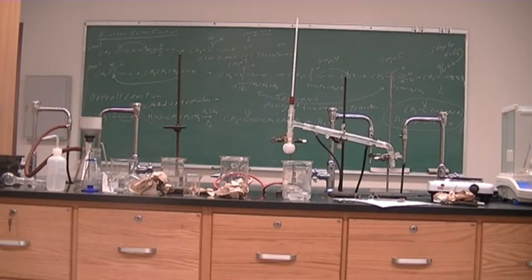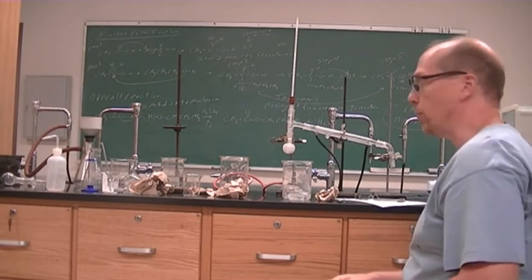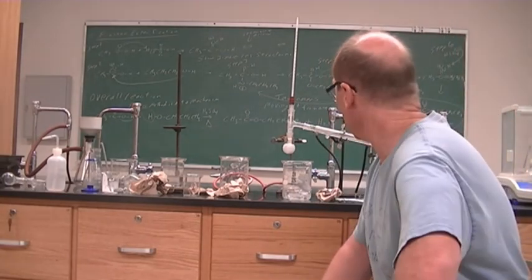All right, and so we have 96.4080. So I don't know, 2.5 grams ish was our yield. All right, that's the end of the Fischer Esterification.